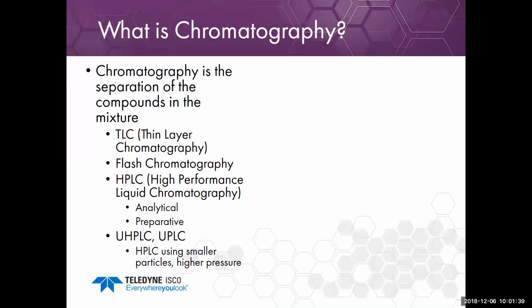So what is chromatography? Well, for our purposes, chromatography is the separation of compounds in a mixture. Because we're talking about preparative LC, I'm not going to spend any time on analytical HPLC, except how can I use analytical HPLC to help me develop a preparative method.